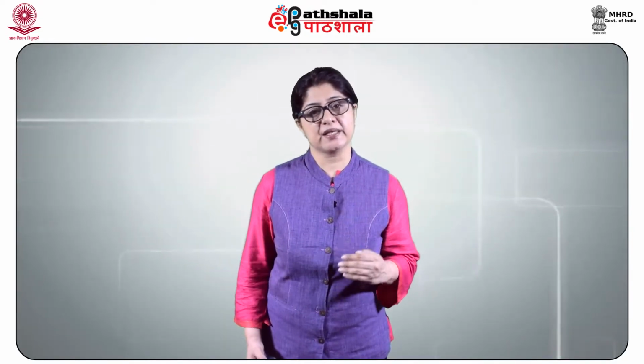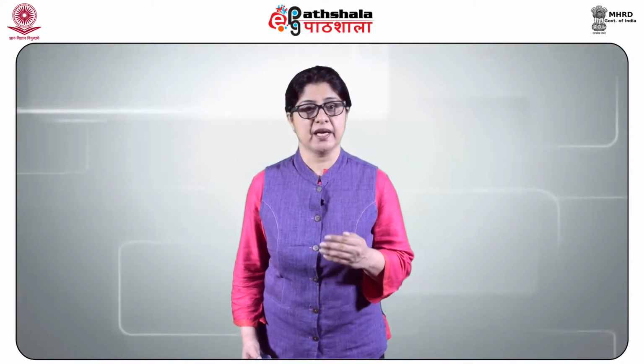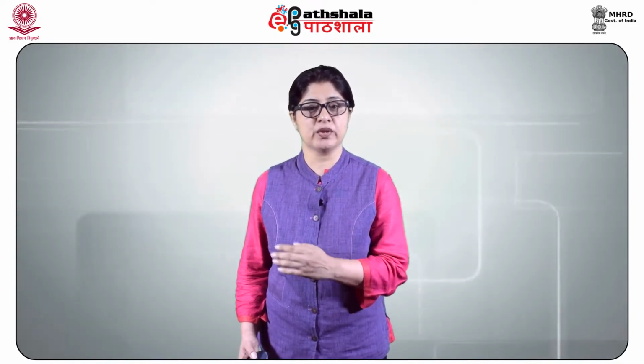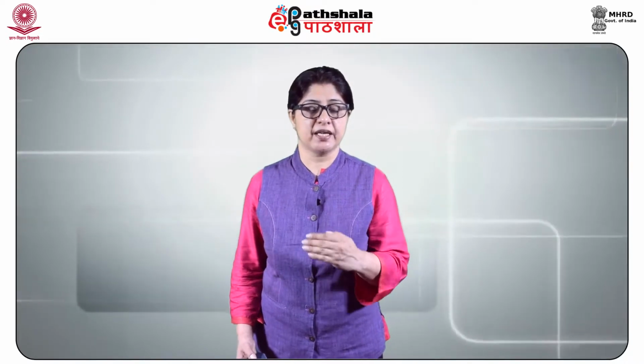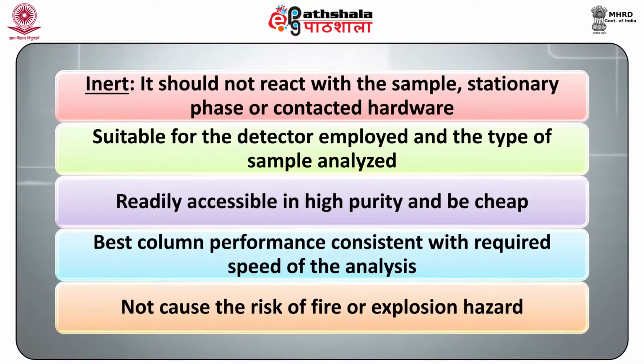A carrier gas is required in a GC system to flow through the injector and push the gaseous constituents of the sample into the GC column, which leads to the detector. For selecting a carrier gas, the following considerations should be taken into account. Firstly, the carrier gas should be inert; in other words, it should not react with the sample, stationary phase or contacted hardware.